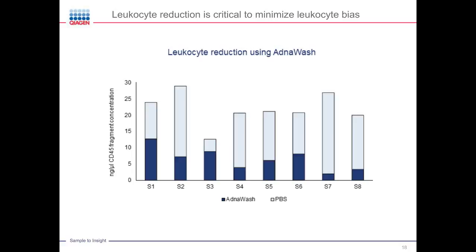really too much. It took quite a while until we found a solution for how we can reduce the leukocytes by another log to 100 to 150 leukocytes. And this is possible due to a special washing buffer we developed, which we use instead of PBS during the first washing steps on the magnetic beads.